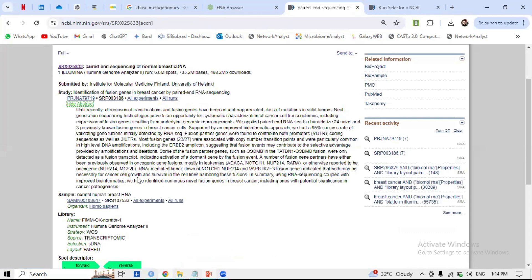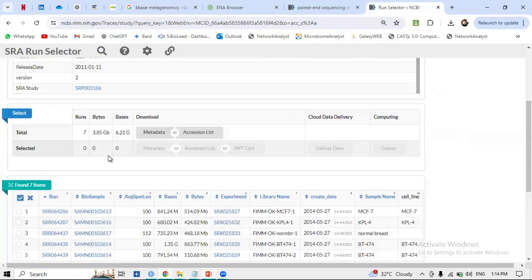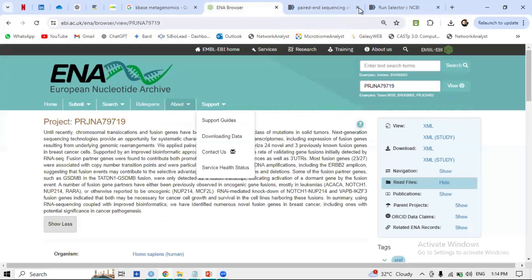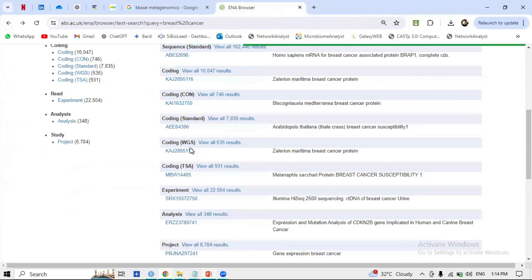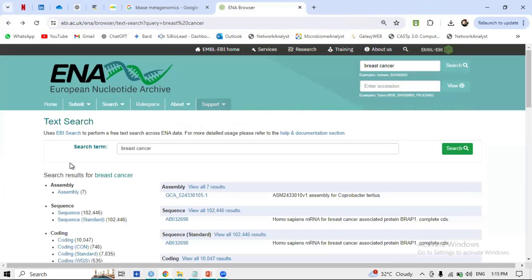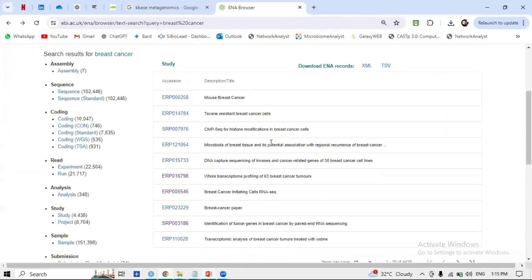The main thing is that we are interested in samples related to breast cancer. You can select those samples and proceed. If you want to search for another study, go back to ENA, click on 'Study,' and check more options. You can check, for example, 'Whole Transcriptome' studies related to breast cancer.